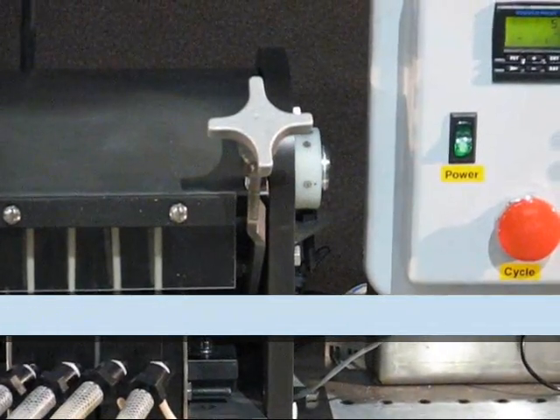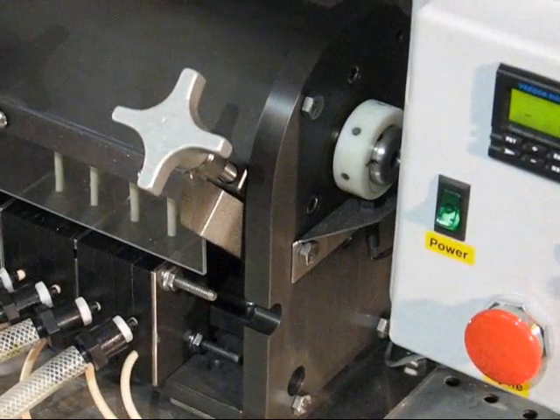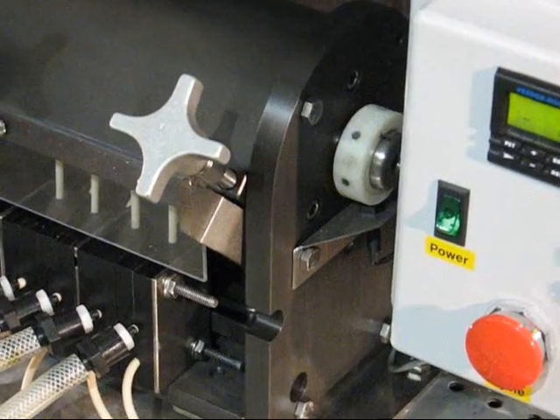You can see the metering wheel that tells the controller exactly what the position of the pump is. You can see by the position of the magnet that the rotor stops in the exact same position each time for a precise, repeatable dose.